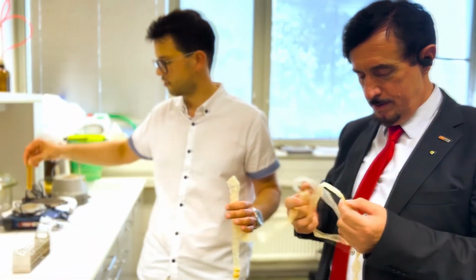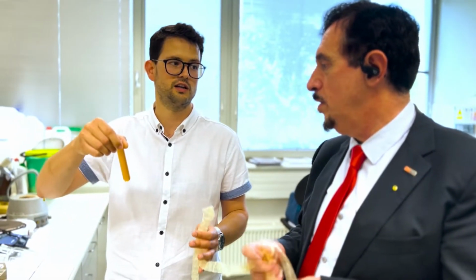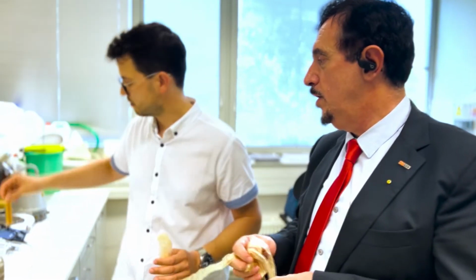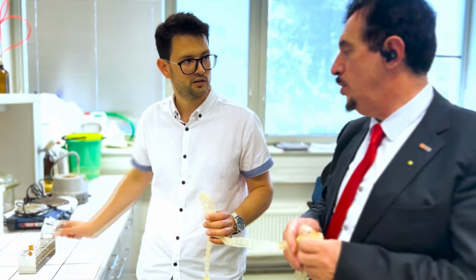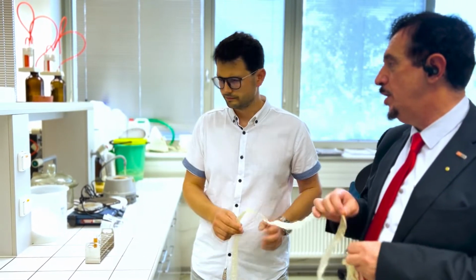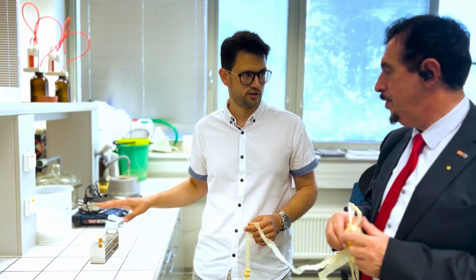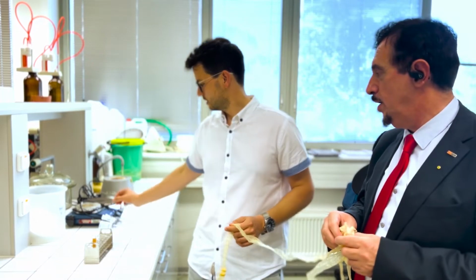But this is just one part, because it has been known for a long time that it can be done, and the challenge is to do it sustainably, which means in an economically feasible way. Okay. And what are the chemicals you use? Just water? What is the hydrolysis? At what temperature? It's at moderate temperatures because we use an enzyme technology. Yes, so it is enzyme technology.